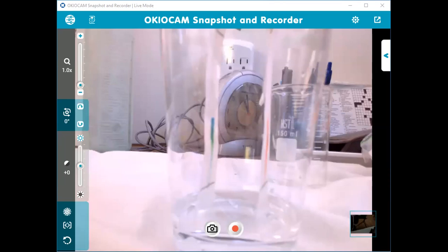Let me actually try to write this. Your actual water line will probably be different from that finish line, the finish line you originally marked. The finish line is just a goal, so that you have an idea of when this experiment is going to end, when you should pull this paper out. But the idea is that you are going to pull this out at some point.